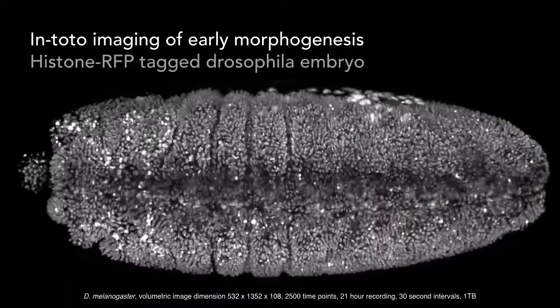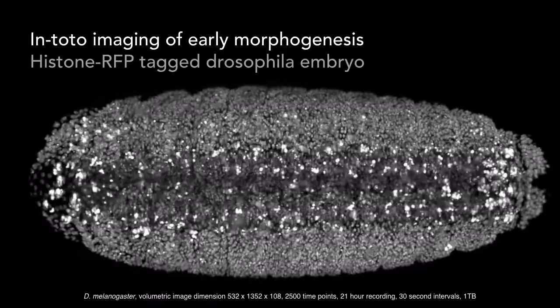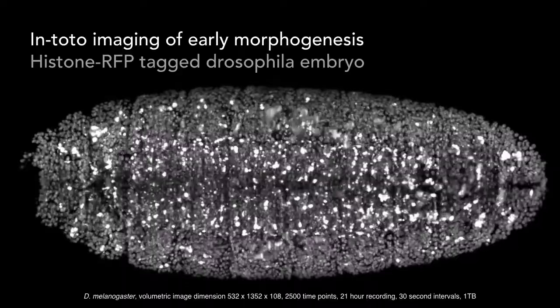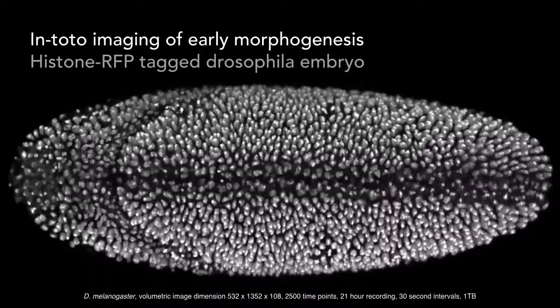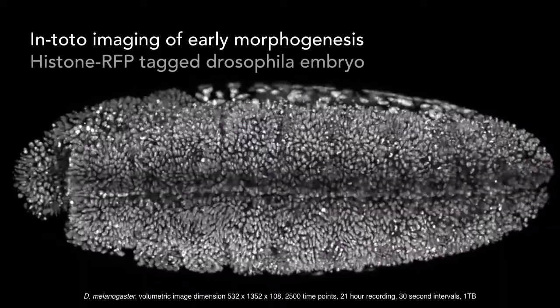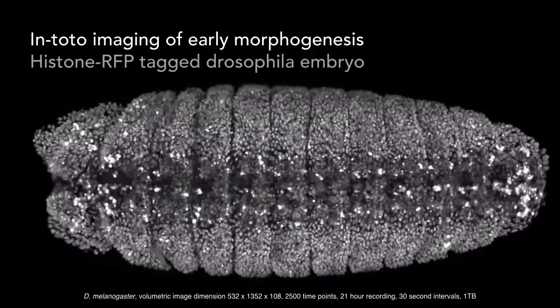When discussing with Jim Karnakias, who is at the Biohub, the vice president and leader of the data science team, our discussions are oftentimes on the terabyte and petabyte scale, and how do we make sure that the machines we're going to build are actually capable of storing this? I mean, where do we store all this data? So there's clearly a challenge there. The key interesting thing here is also that, because of the adaptivity of the microscopes, we have a very fine, exquisite resolution. We have nearly cellular resolution throughout the embryo over multiple hours.